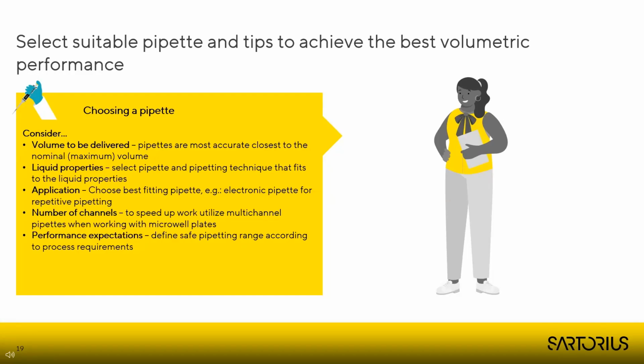And then the second one is kind of obvious actually. Pipette the assays correctly the first time. So then you don't have to redo experiments. That's not only saving on the consumables and reagents and samples, but it's definitely saving a lot of time. And having a pipette tip combination that works perfectly definitely helps to perform the prep steps right the first time.